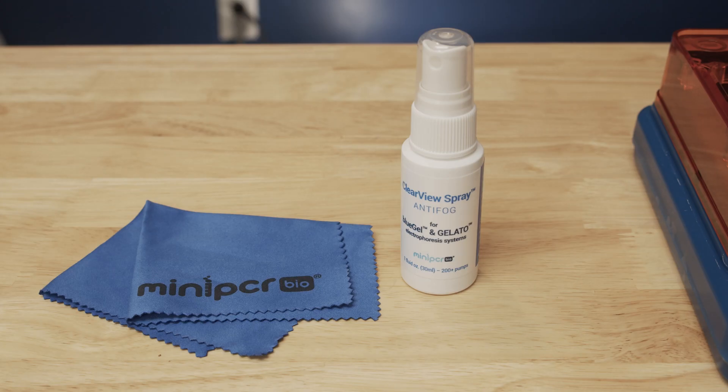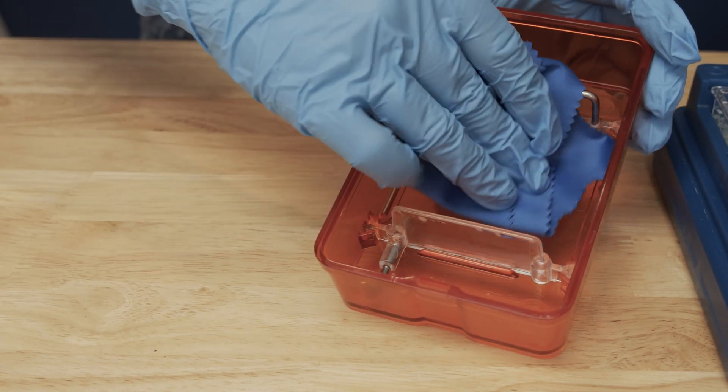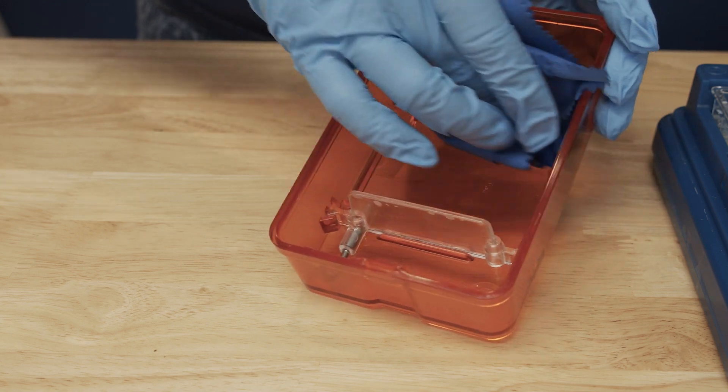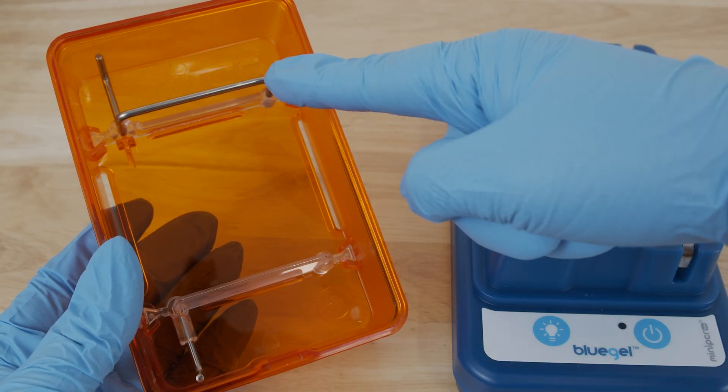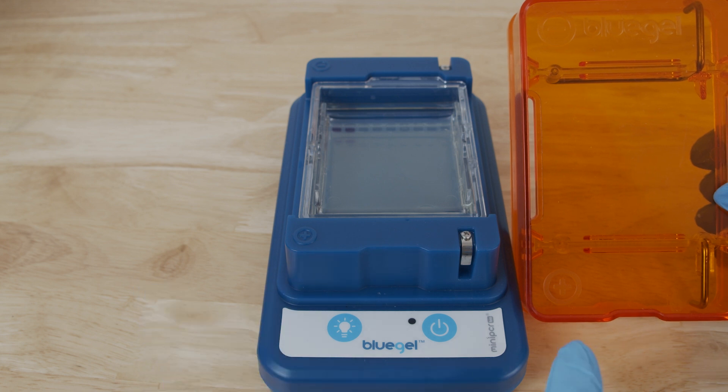Your Blue Gel System will include ClearView spray and a small microfiber cloth to prevent condensation. Spray a single pump of the ClearView spray onto the inside of the orange cover and spread it with the microfiber cloth. The orange cover contains the electrodes and can only be placed onto the base in the correct orientation.